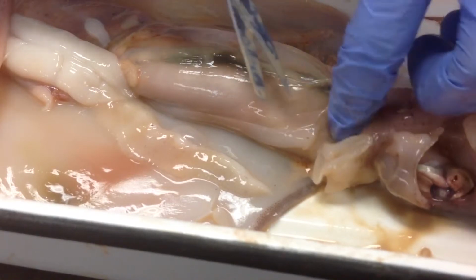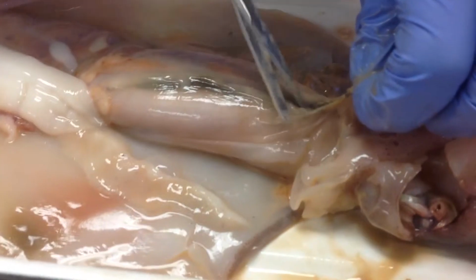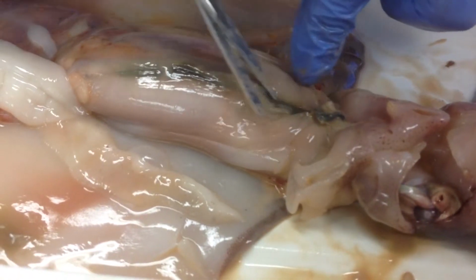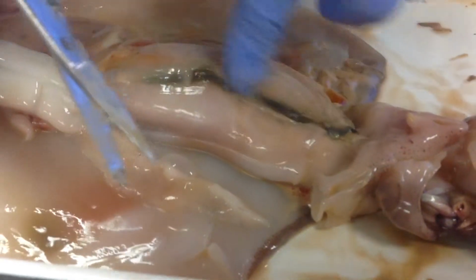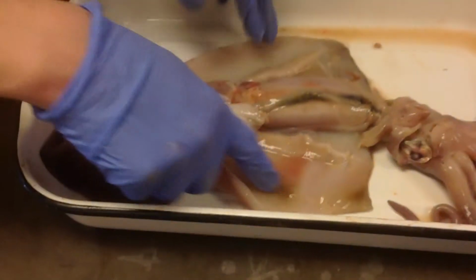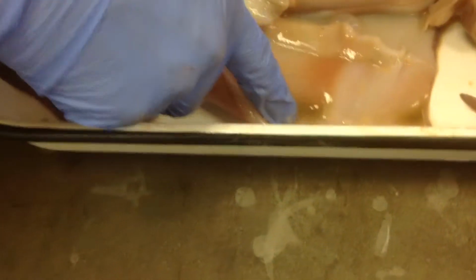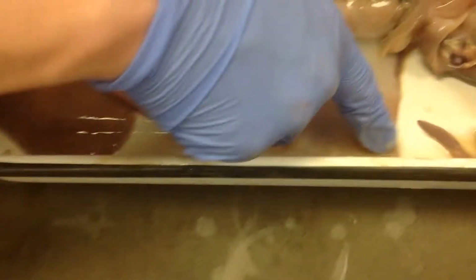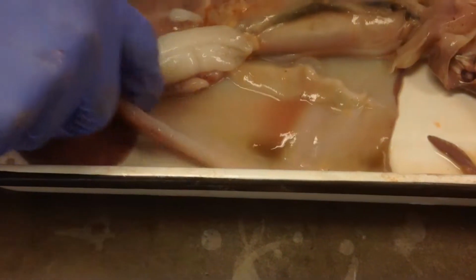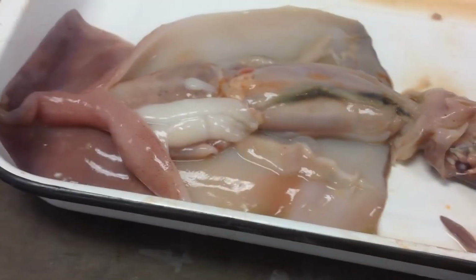There's this brown bile that seems to be coming from this main sac here, which leads me to believe that is the stomach. Have we gone into the... We've gotten into this. It's mostly dried out, but there are remains of some sort of black liquid. Yeah, but definitely this discoloration, I definitely think that's an injury of some type. You can definitely feel there's a lack of tissue where these bruises are, which I like to assume they are. This discoloration is definitely damage from whatever killed it, maybe. But it doesn't seem to have reached any vital organs.